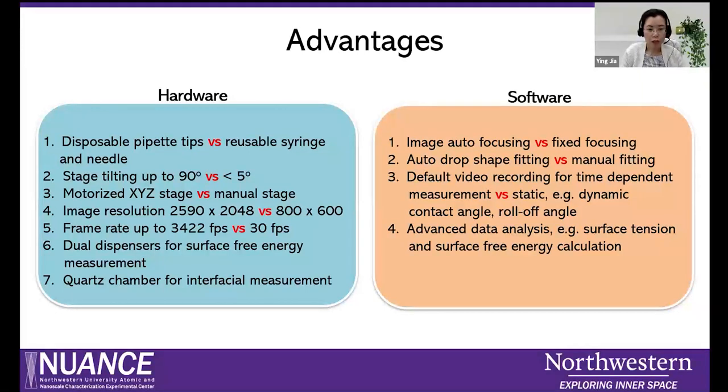Additionally, we have a quartz chamber. That one is just a little cubic chamber holding liquid, and I will also show you the usage of this chamber later.